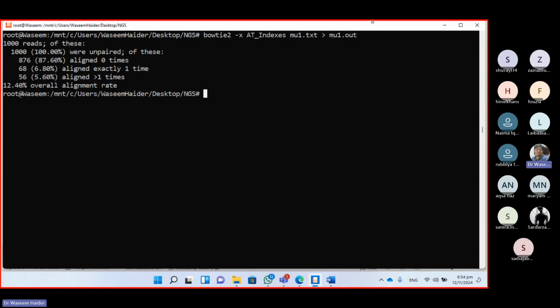Okay, so that's the file. Now he's not writing anything. He gives us statistics. He said that 1000 reads were unpaired, and they were used, and they were single reads, not paired ones.